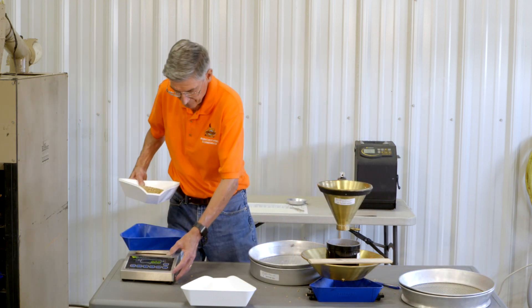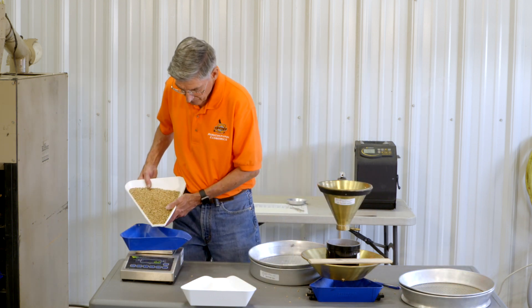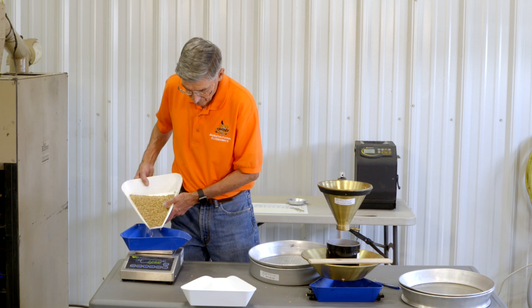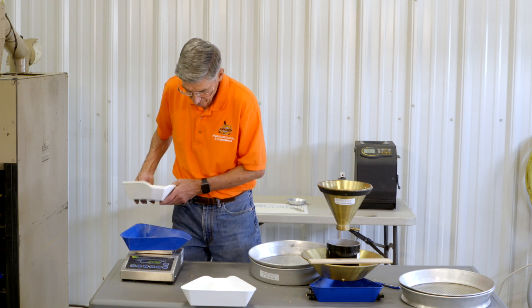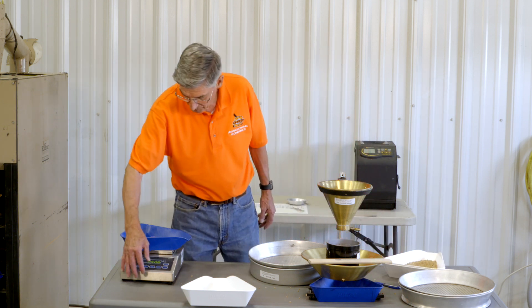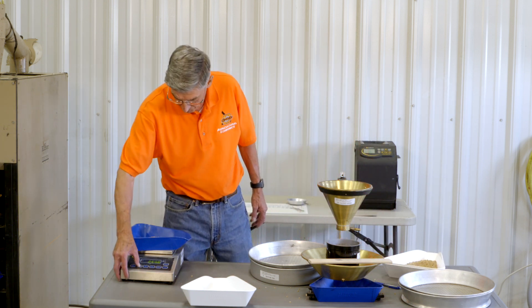We now need to weigh out about 250 grams to calculate the shrunken and broken by screening it through a 0.064 by 3-eighths slotted sieve. I have 251 grams. I'm going to set the memory so it will calculate the percentage for me.